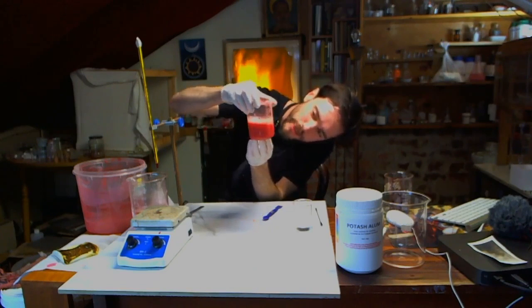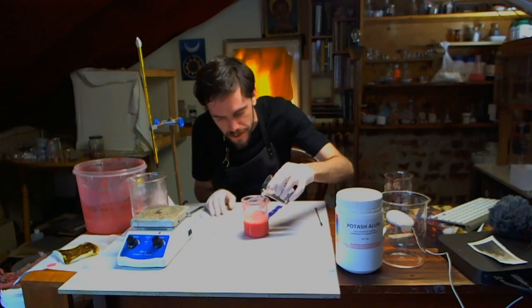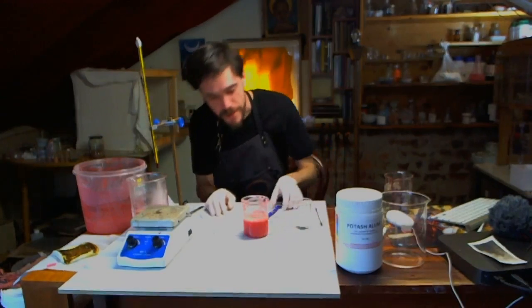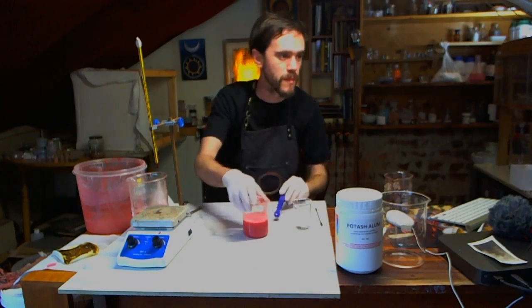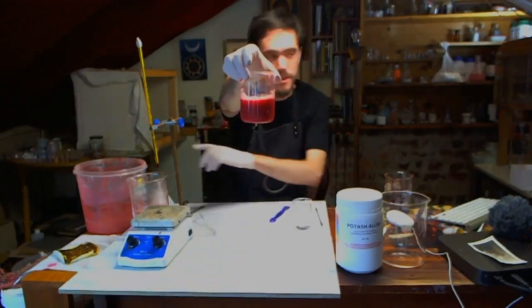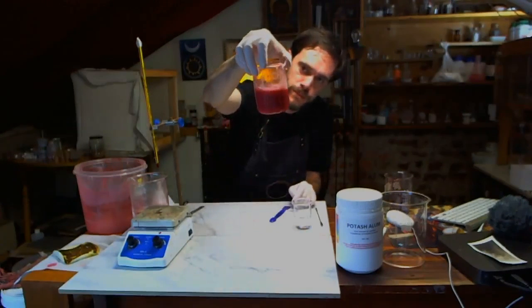So we're definitely getting a precipitate. I'm not sure if we're done yet here. Yeah, there's definitely more precipitating out. It's similar in color to what we yielded in the bucket there.